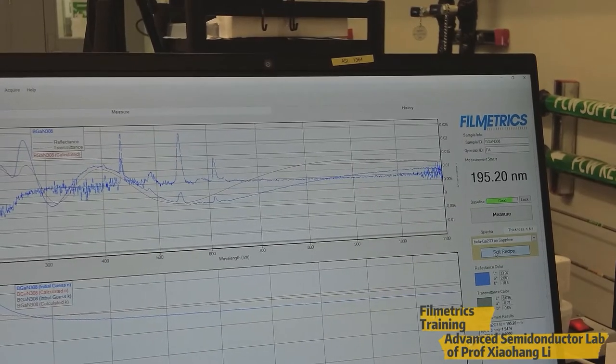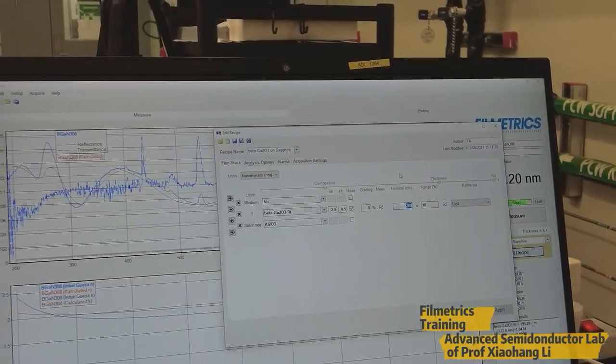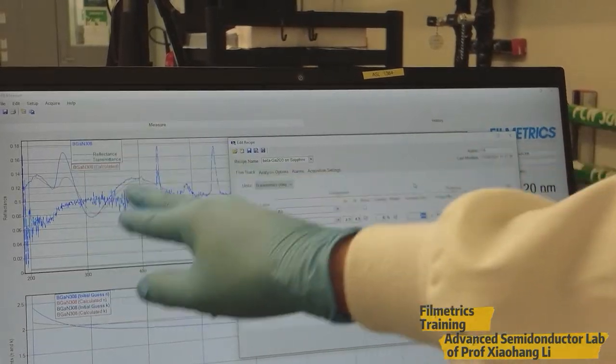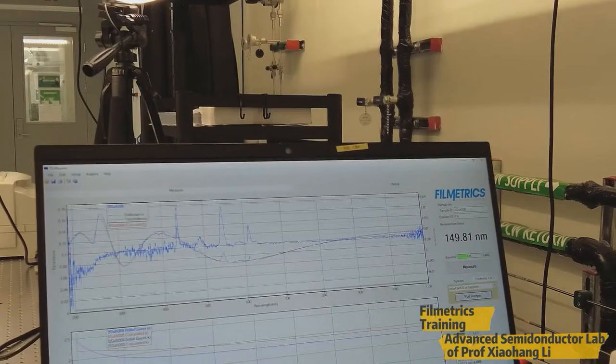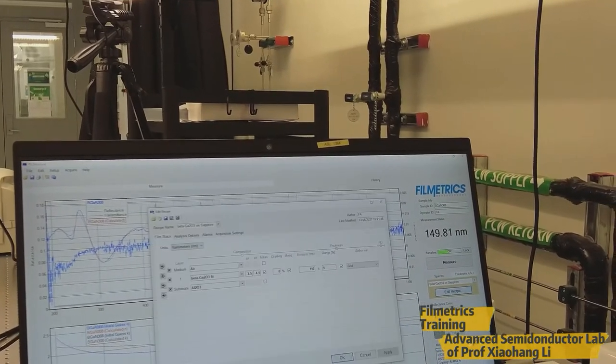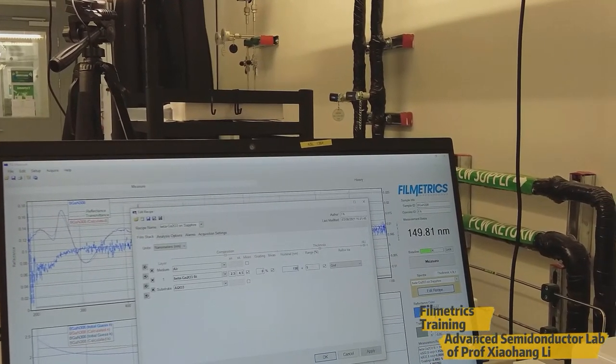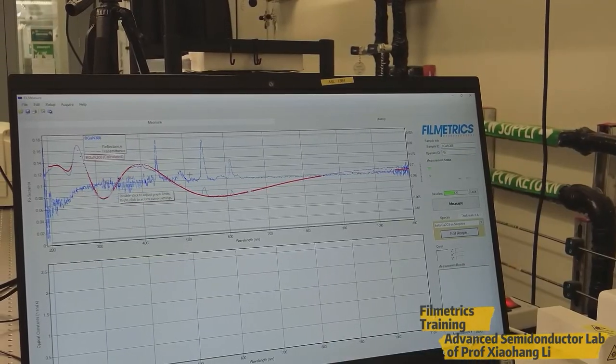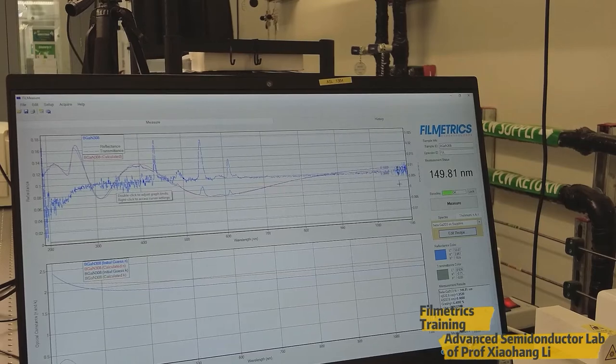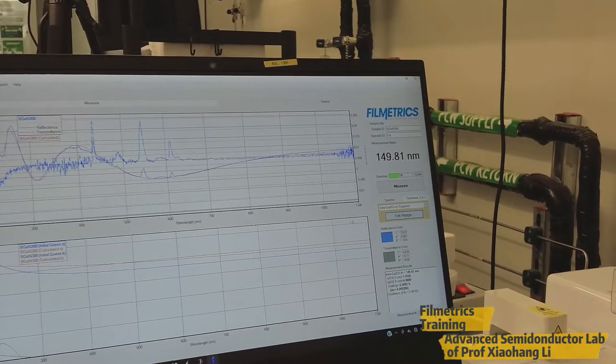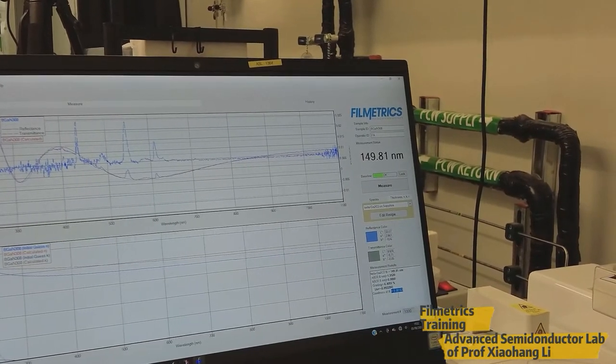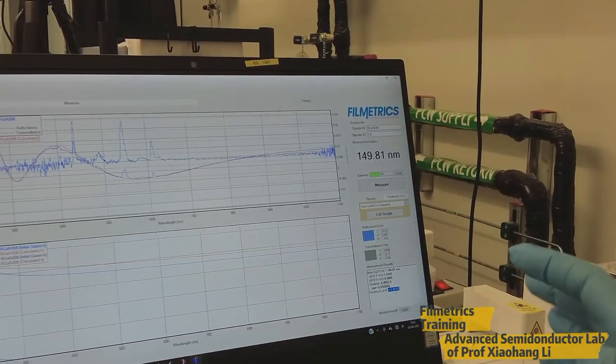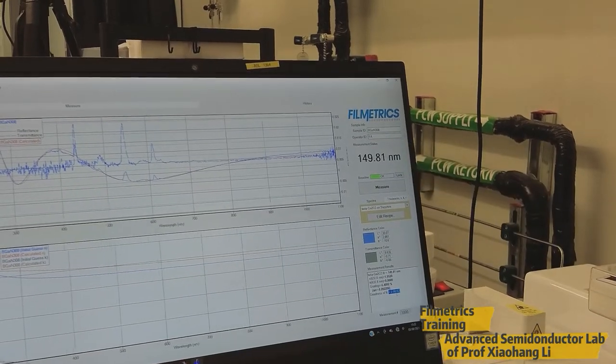So what we can do is, we need to increase or decrease according to the number of oscillations we have. It is having only 2 oscillations. The thickness might be less than 200. So let us give 150 and see how it is going to fit. Since it is fitting well, that means the thickness value is around 150 nanometer. And the goodness of fit is around 98 percentage. That means it is fitted well and the thickness value is around 150 nanometer.